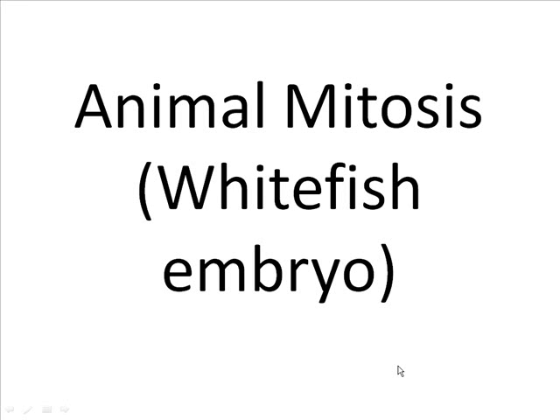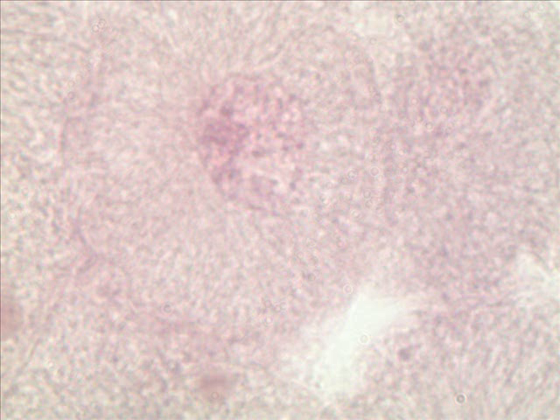Hello there. In this set of slides, we're going to see animal mitosis as it appears in whitefish embryo, and we're going to take the phases in order, beginning with interphase, then prophase, metaphase, anaphase, telophase. All right, let's begin with interphase.